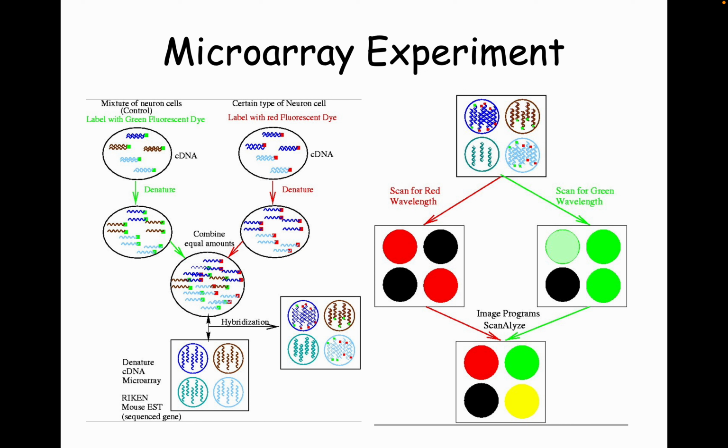Same thing with the pyrosequencing, where they're reading out the spots in each of those little wells and seeing how bright the light is. Yeah, that image analysis is actually done in a proprietary way. Proprietary just means something that the companies keep secret from us. It's operating by what are presumably fair principles. It's just that that's their intellectual property, how they actually do this. You can do it yourself.